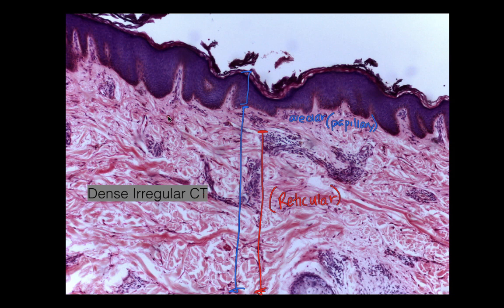You'll also see that the pink here — those are all the collagen fibers. In the dense irregular connective tissue, those collagen fibers are banded together, so you get these really thick stripes. Versus the areolar connective tissue up here, it's not banded together as much, so you see a more smooth-looking layer.